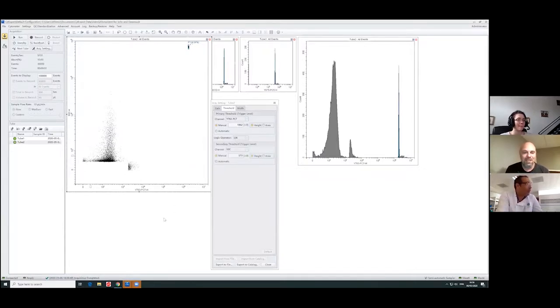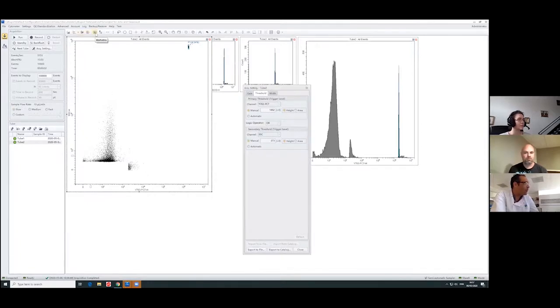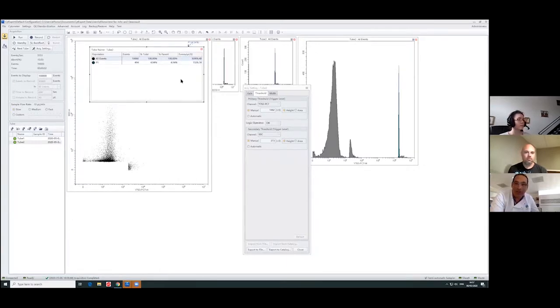So the other thing I want to show you and explain is how many events you want to record, and for how long. So 10,000 events if you're working with cells. Because if you say 10,000 and you look at your statistics here, only 4% of those are my beads.